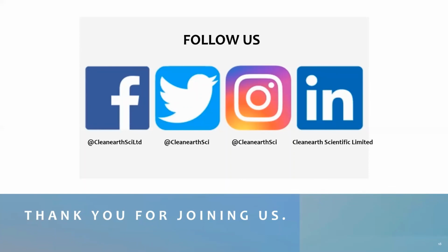So if you have a type 2 or even a type 3, you can get type 1 by having an additional system that we normally call a polisher, for example, and we'll polish that type 2 or 3 to type 1. That's the only upgrade you can have. The other upgrade you can have is basically buying a completely new water system, but no additional filters per se will upgrade your water to type 1 water from type 2 or type 3.